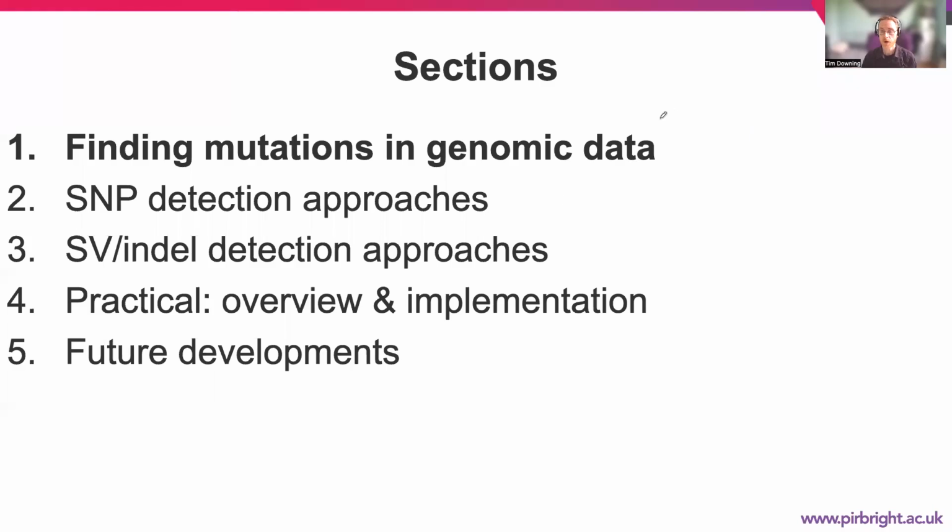Okay, welcome to video 1 of our course G04 on mutation detection. In this part, we're going to look at finding mutations in genomic data and the general area of this and how it fits into what we did previously.